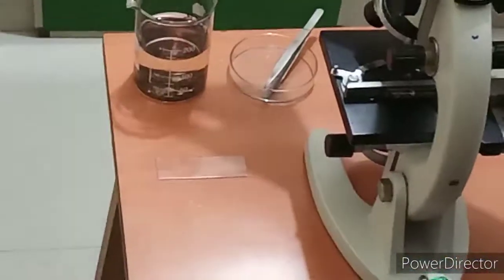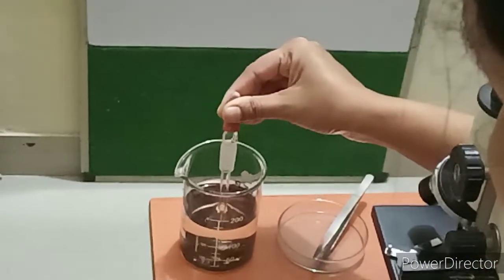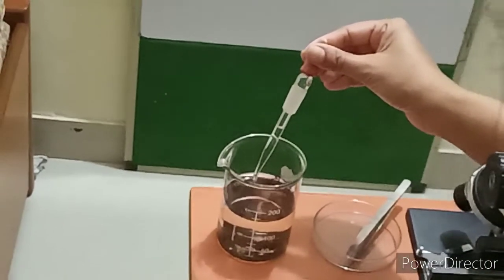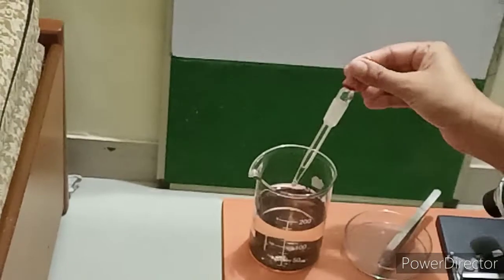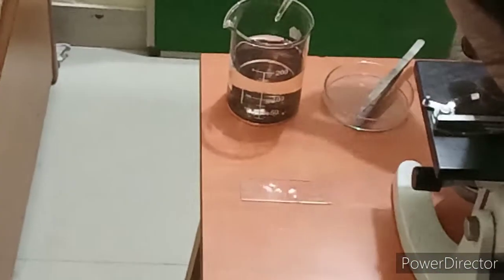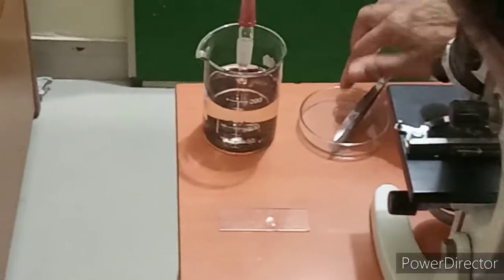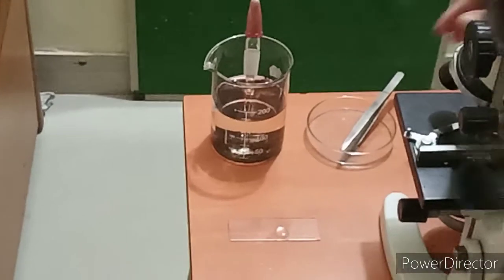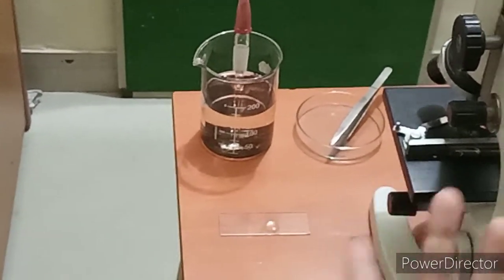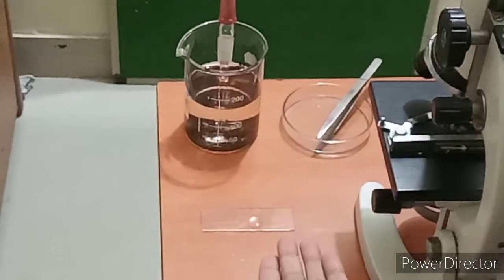Similarly, we are going to prepare the slide for sample B. Now, taking the other dropper for sample B, we are going to dip it in the water of sample B and take a little amount of water in the dropper and take only one drop of water. And we can spread it also, but if we don't want to spread and want to see the organisms live, children, we can directly put the cover slip over this drop of water and observe it.